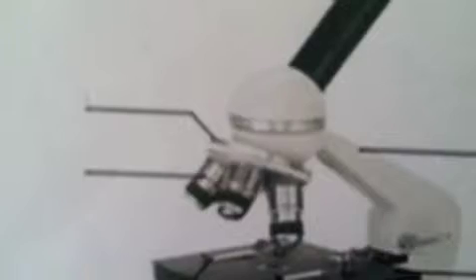The nose piece, which is right here, holds the high and low power lenses and can be rotated to change magnification.